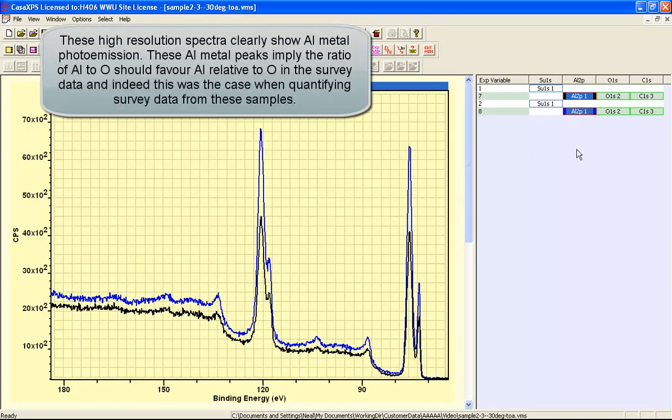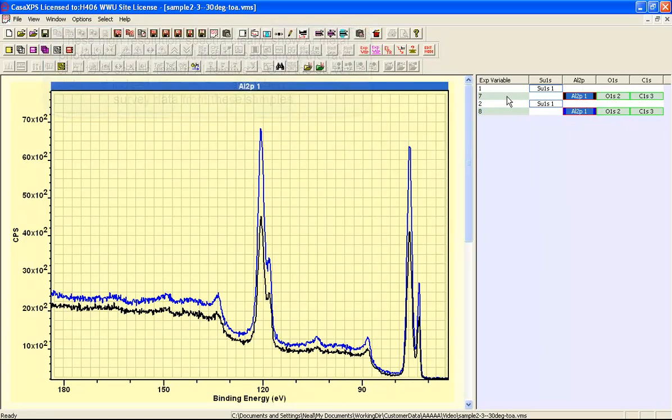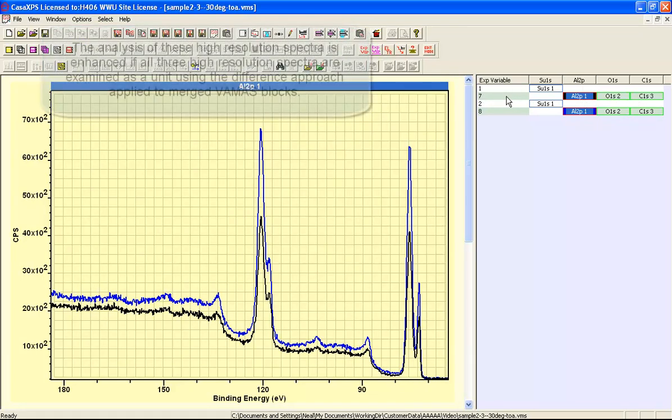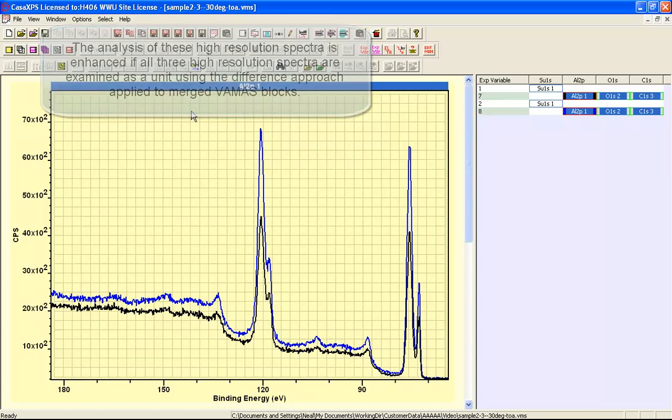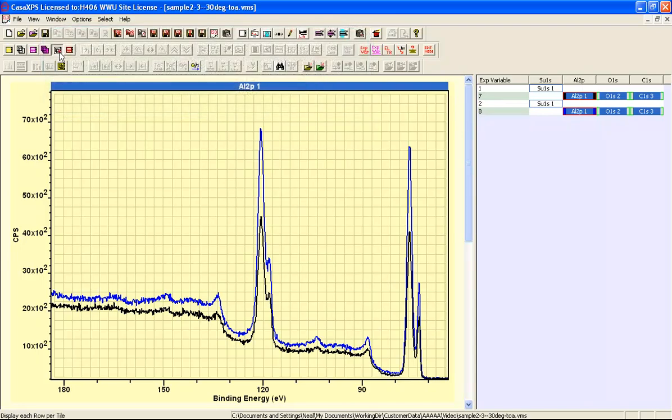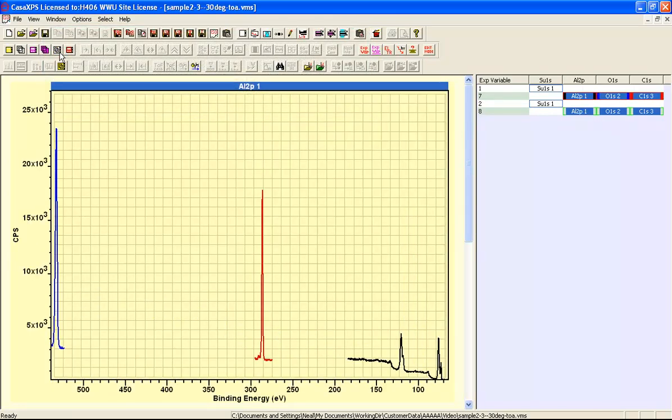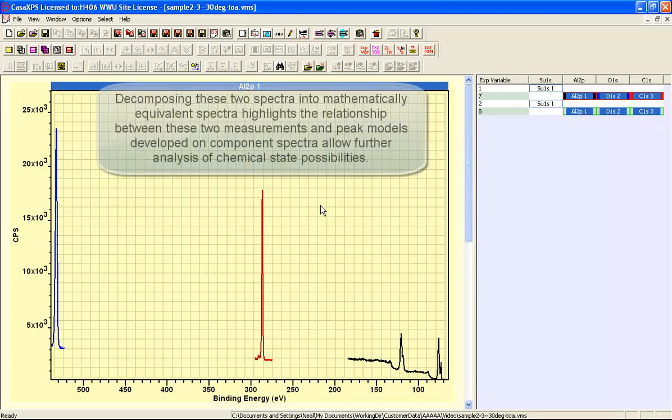While we could create peak models for each one of these VAMAS blocks and then quantify regions and components across these VAMAS blocks, there is an advantage in analyzing the data in a similar way for these high-resolution data to how the survey spectra analyzed. This will involve creating what are effectively pseudo-survey spectra.